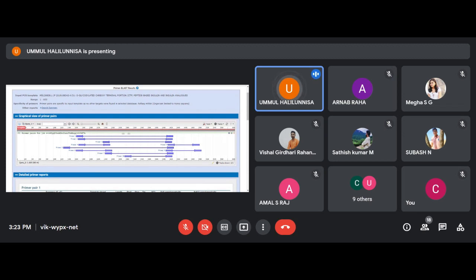The rest of the sequence will be covered with AT content, and 40 to 60% should be covered with GC content to enhance the binding of the primer regions to your nucleotide sequence. That's it. We are going for that one.